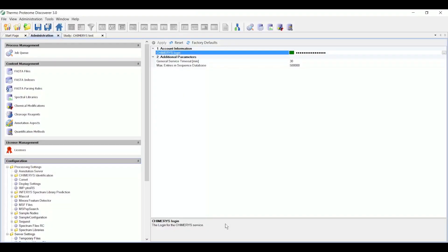Hello. In this tutorial, I'm going to show how to use the CHIMERYS intelligence search algorithm in the Thermo Scientific Proteome Discoverer software.